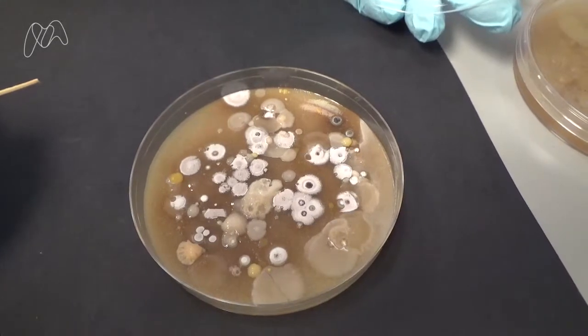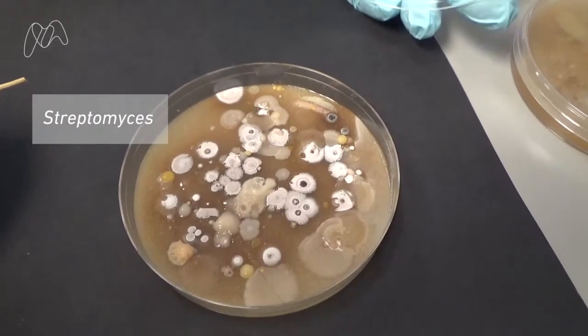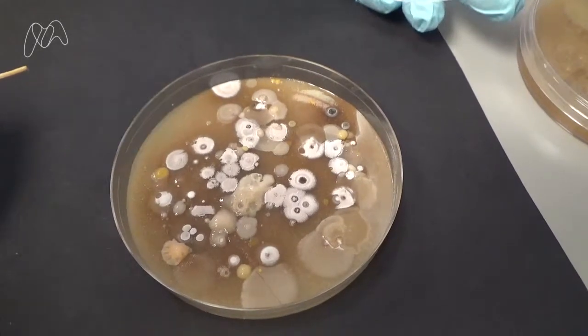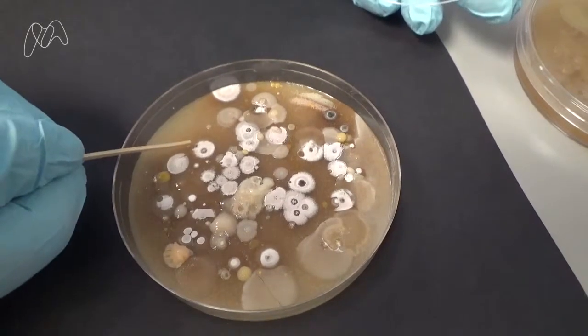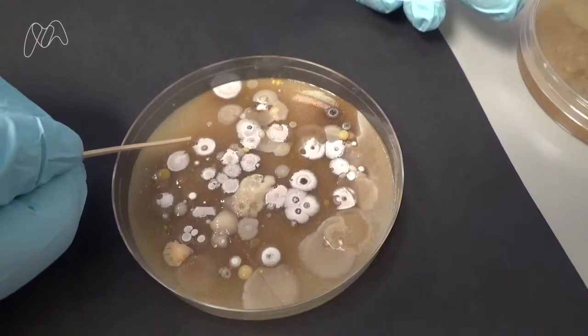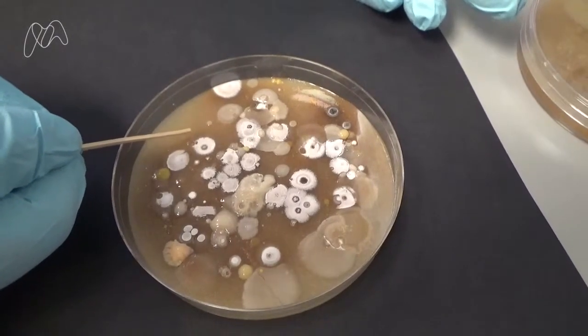The bacteria that we're interested in are called Streptomyces. The reason we're interested in them is because most of all known antibiotics come from these bacteria. These colonies are most likely Streptomyces because they are white, round and fluffy, although it will require further analysis.